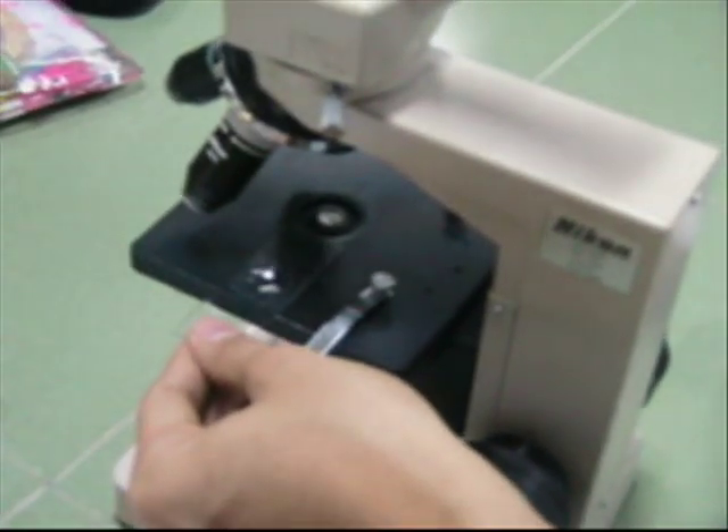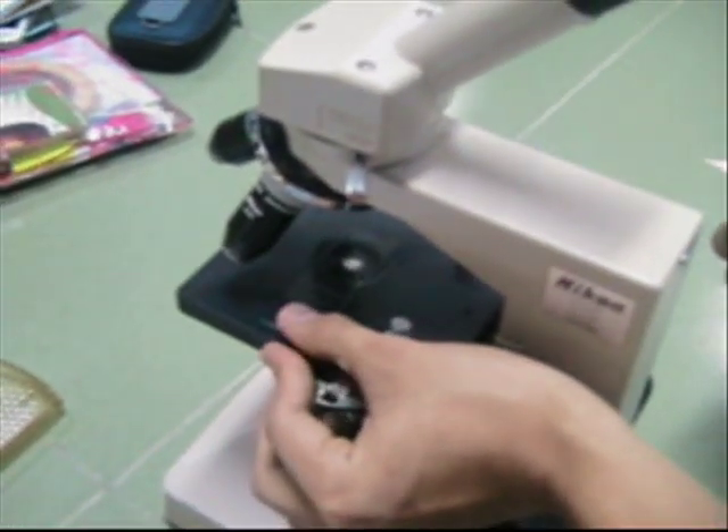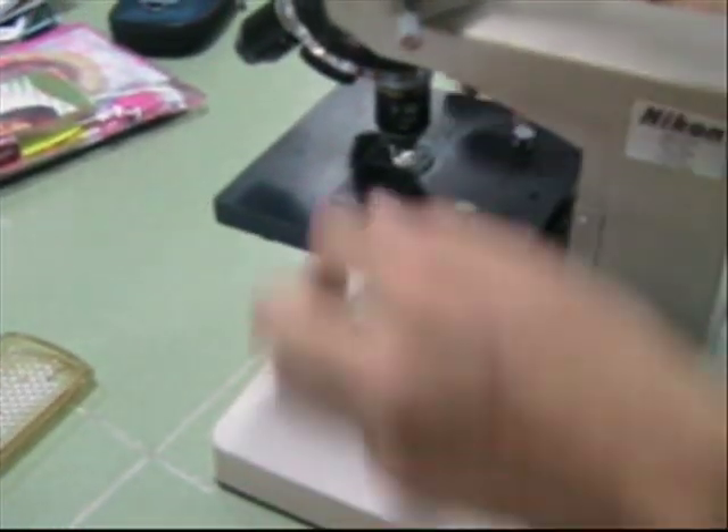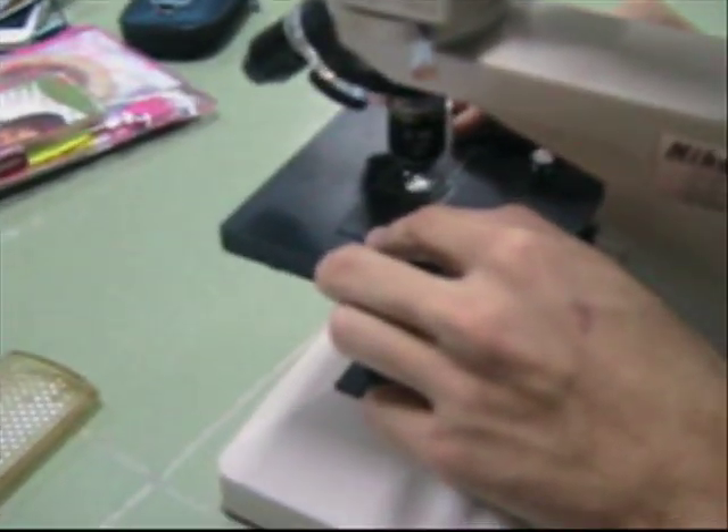A strip of filter paper was used to draw some liquid from the slide. The group was able to observe the cell body.